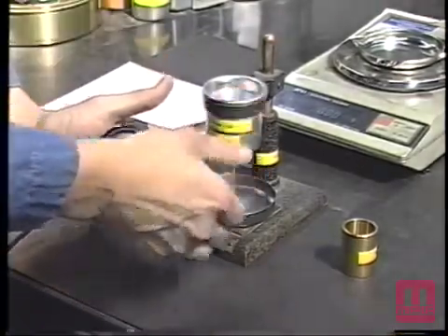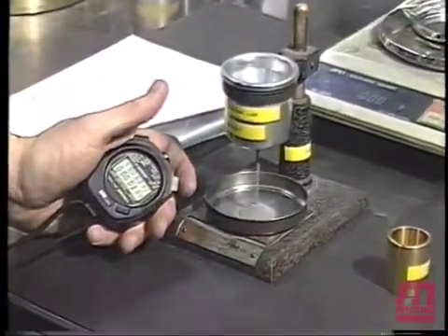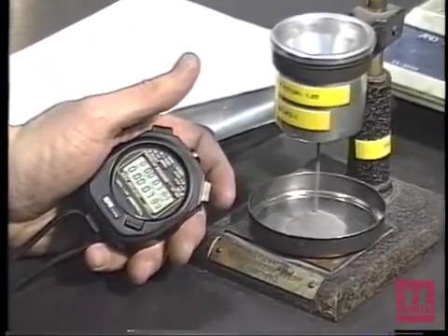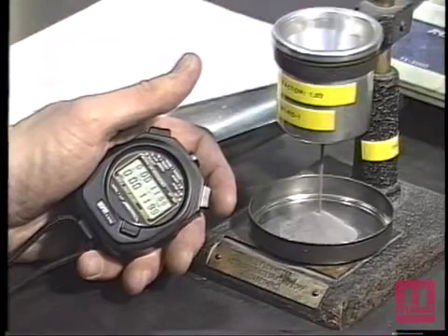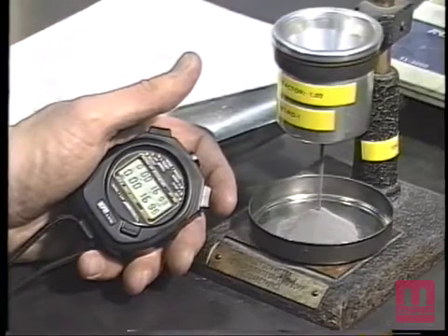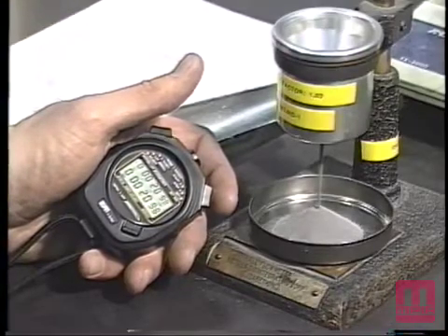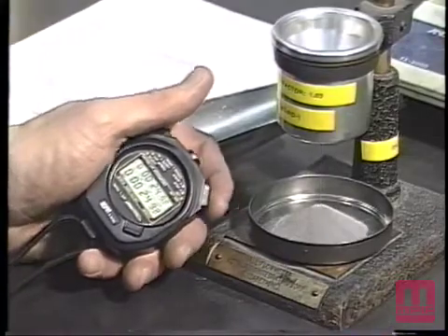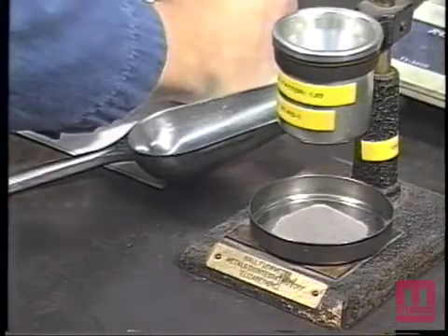The stopwatch shall be started simultaneously with the removal of the finger from the discharge orifice and stopped at the instant the last of the powder leaves the funnel. The elapsed time in seconds shall be recorded.